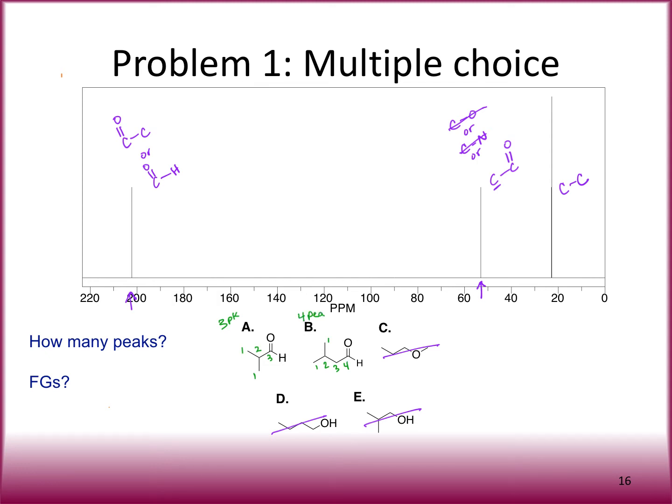So then if we look at our actual spectrum, how many does that have? It has 1, 2, there's actually 2 here. So if you look really closely here, it's thicker there. That's because there's 2 peaks there. Anytime there's something like that, I'll usually also make a note of it if there's 2 peaks that are so close it's hard to tell. Okay, so that's actually 2 peaks. So then we're going to have 4 peaks total. So then that matches B, right?